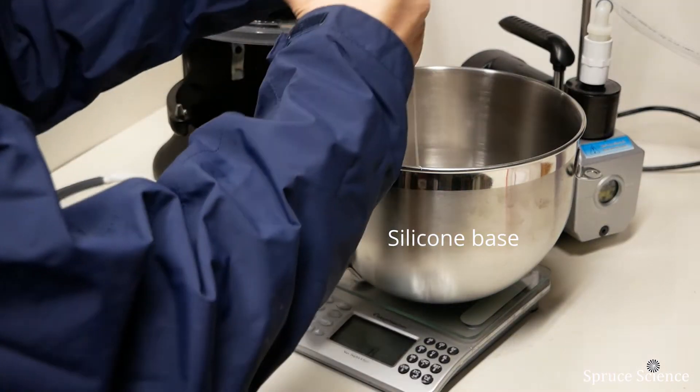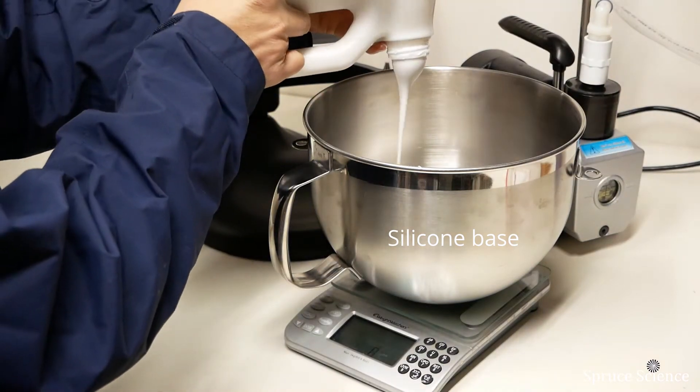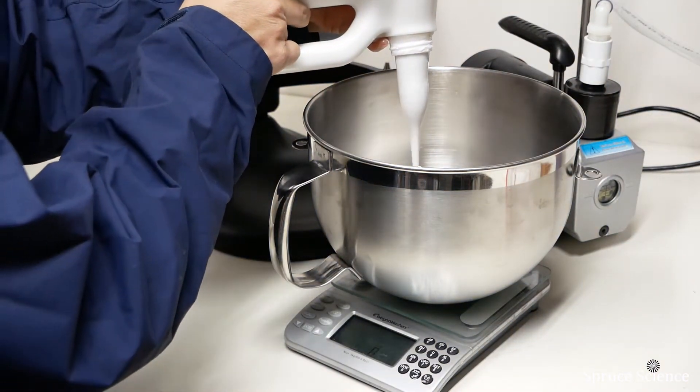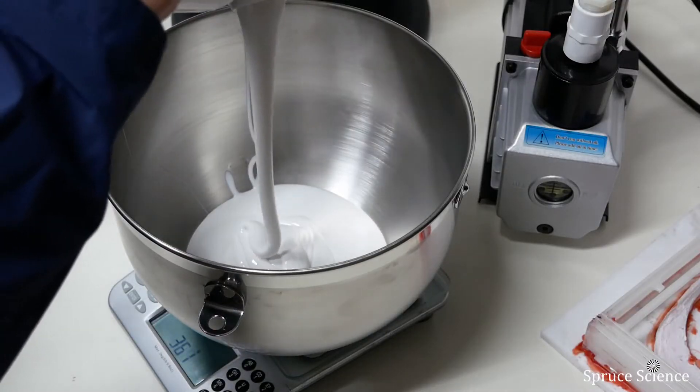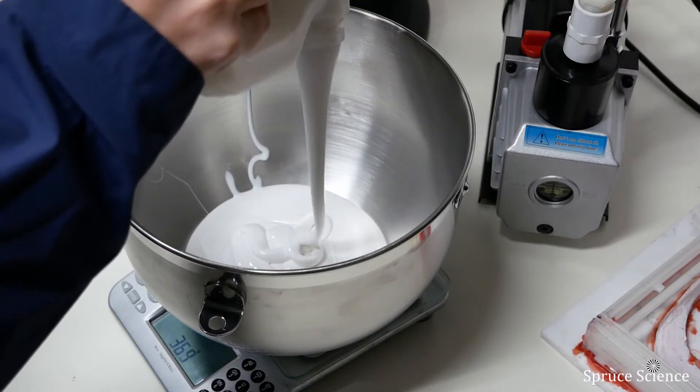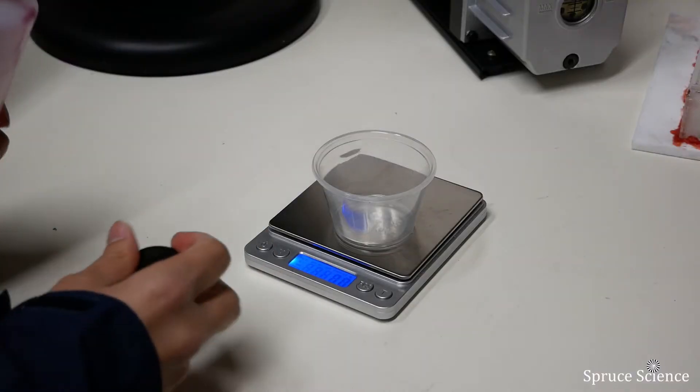People often work with two component systems such as silicone and epoxy. When you are working with these polymers, it is important to mix the base and curing agent completely for proper curing and cross-linking.